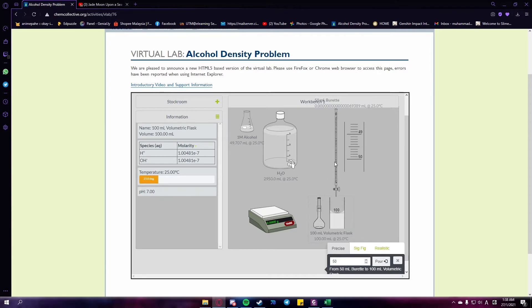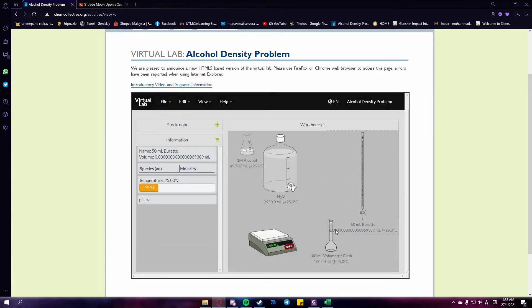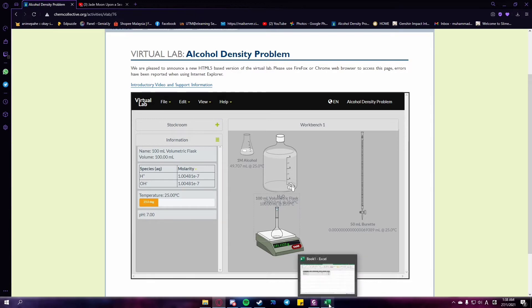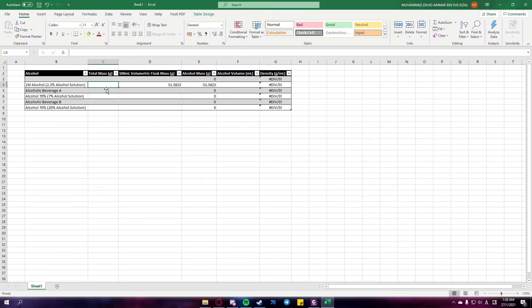Next, pour 50 ml of the 1 molar solution into the same volumetric flask. After that, record the mass. Then we need to calculate the density of the 2.3% alcohol solution by dividing the mass over the volume.